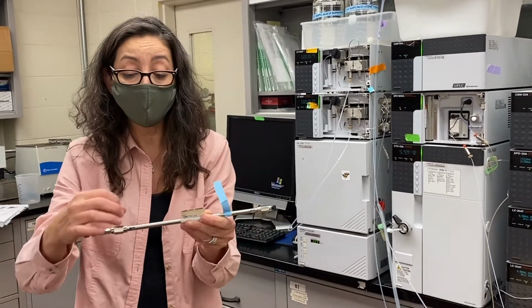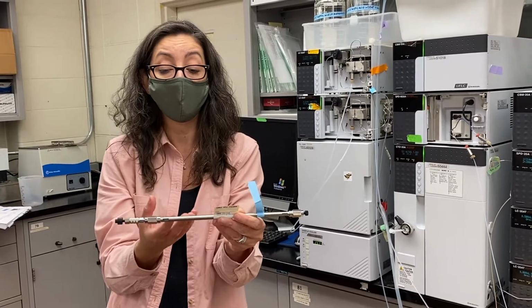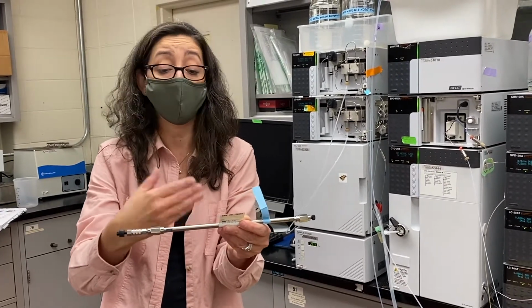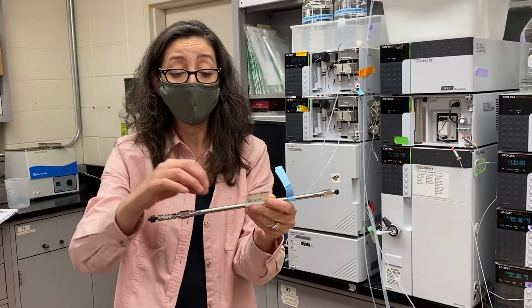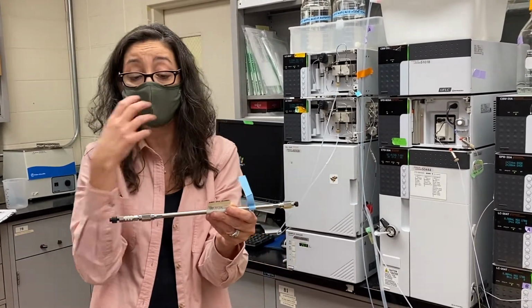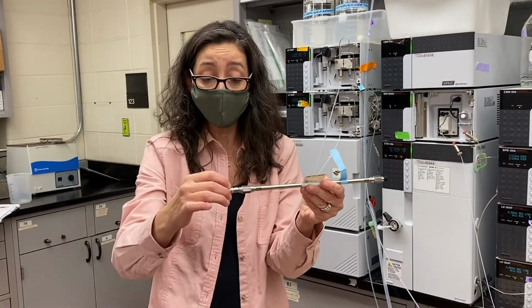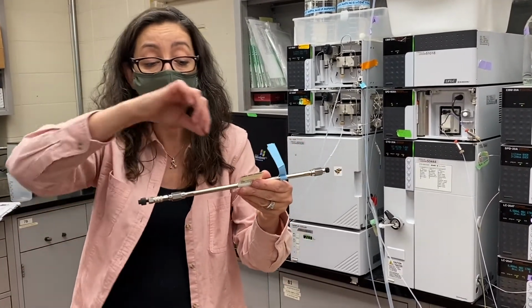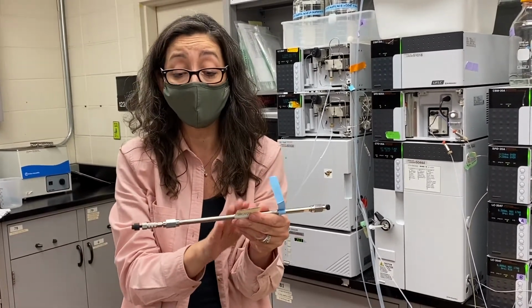So when your sample goes in, the functional groups will not be available for the sample components to interact with the column. So we need to protect that column from being contaminated and blocked, the stationary phase from being blocked. So the guard column is made up of the same material as your column. So it's made up of C18 as well.